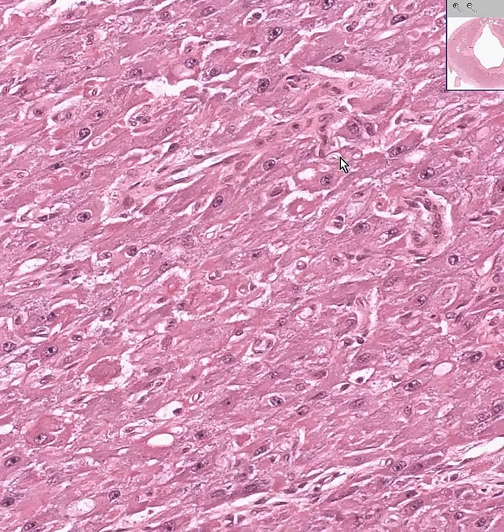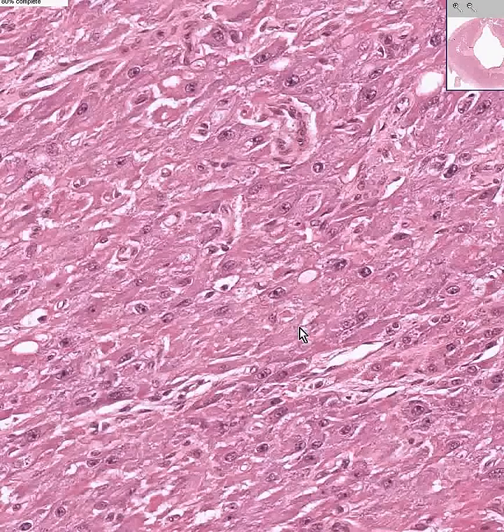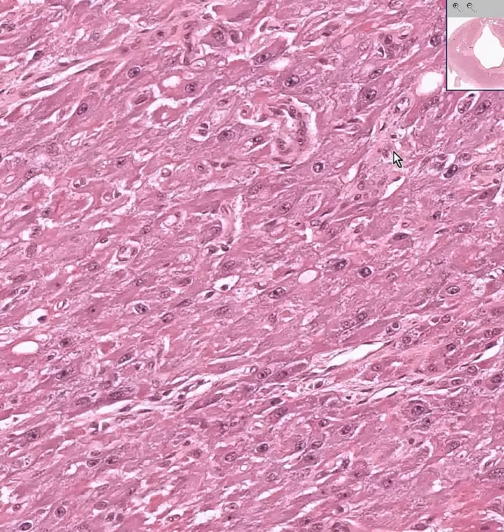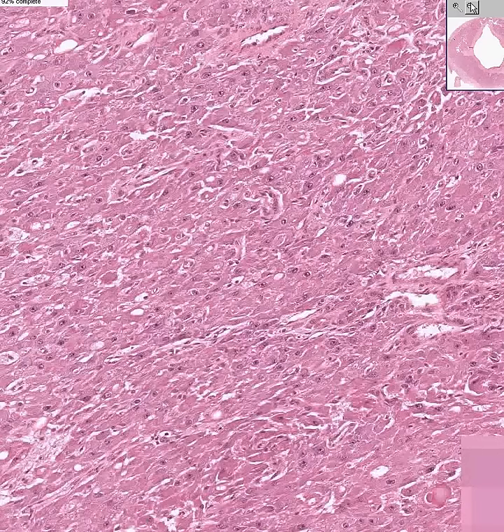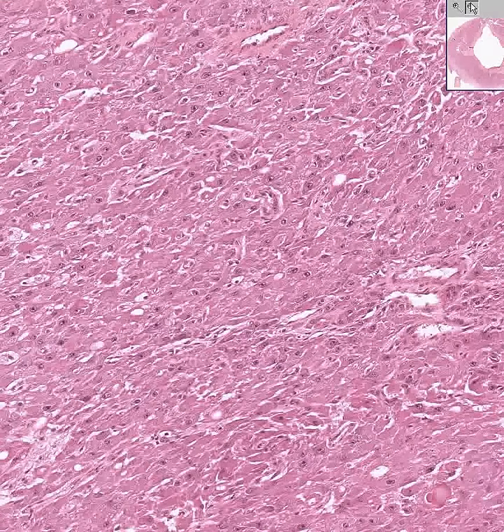You can see that's a blood vessel, and that's a blood vessel, and that's a blood vessel too. But these are basically all luteal cells.